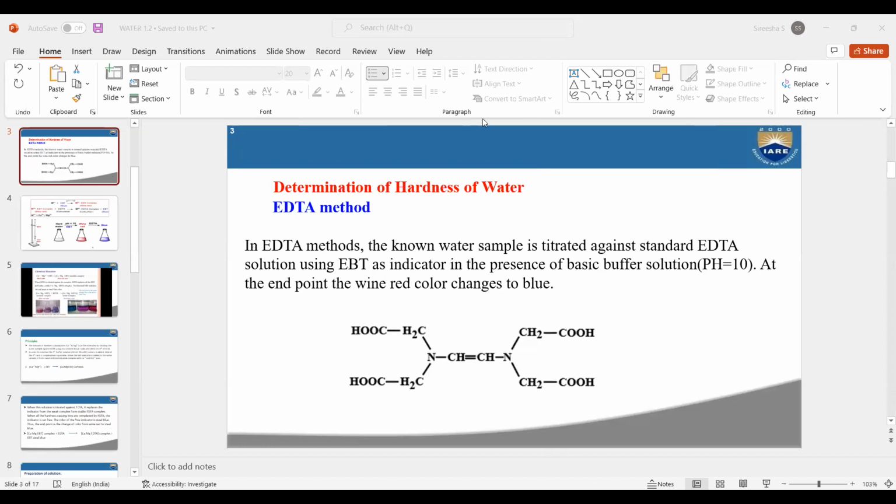Okay, so what is the full form of EDTA? Anybody? Ethylene diamine tetra... Are you listening? What is the full form of EDTA? Ethylene diamine tetraacetic acid.